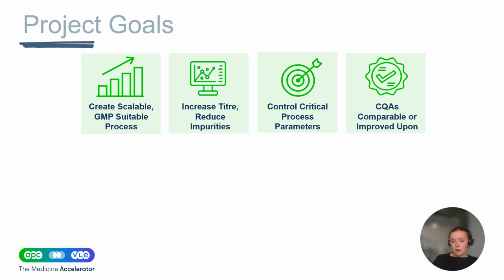So getting in our client data, doing our process development work, and then scaling that to our GMP colleagues over in VLE, having everything in the same place was really important and very, very useful to the team. We used accelerated process development. So we started with the end in mind, looking at manufacturability, our operators in VLE being on the journey with us, and then the procurement of our raw materials and our single-use technologies. So ensuring that everything that we used or planned on using could be used in a manufacturing suite.